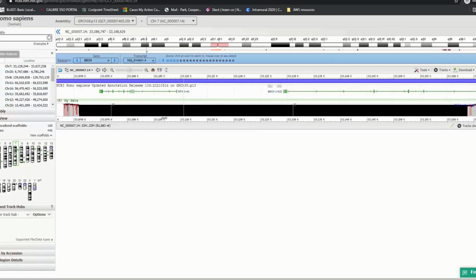Well, it's probably not a surprise to most of you that a giant gap covering a gene and a half is probably significant in the diagnosis of a potential clinical disorder. So we're going to try and use some NCBI track data to help make sense of that finding.